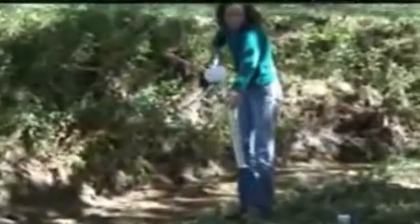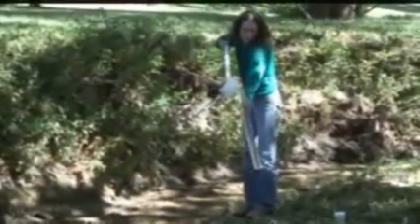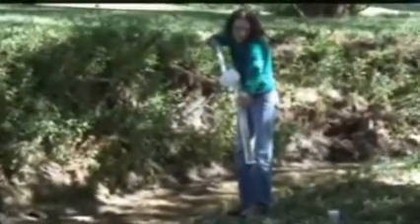Fill the turbidity tube with your stream or pond sample. Be careful not to stir up sediment from the bottom while you're collecting your sample.